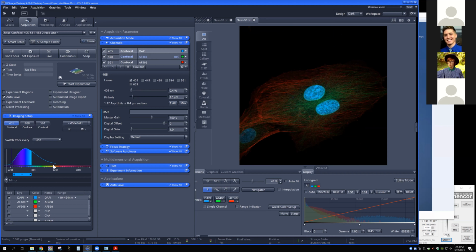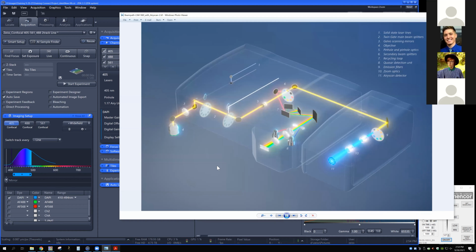And what I want to show you is when I'm doing it like this, I'm basically just doing a line of blue, a line of green, a line of red, and then moving down and doing the next line. So this is going to be faster in the long run because we don't have to wait for the laser to fly back between every track, but it's so fast that we don't have time to change any hardware in between. And so that means pretty much everything.